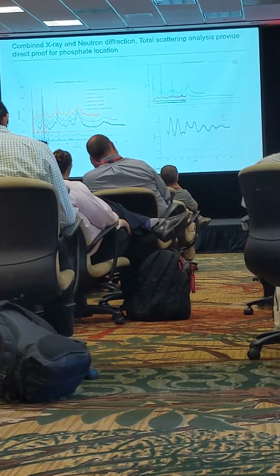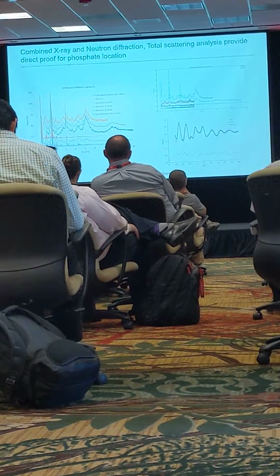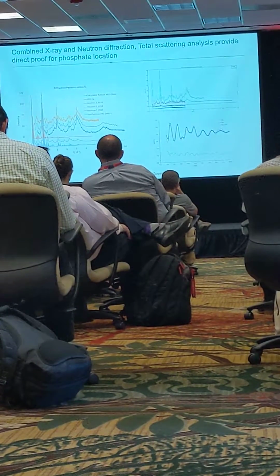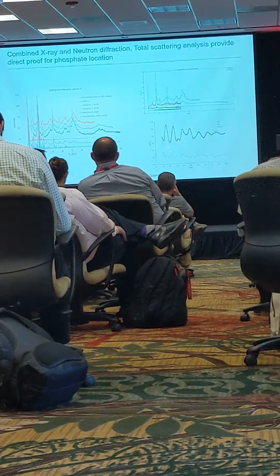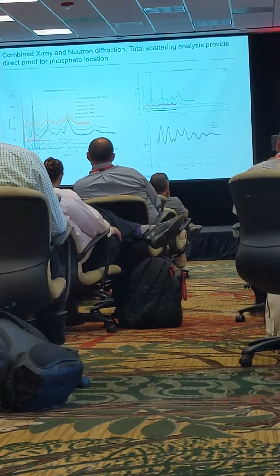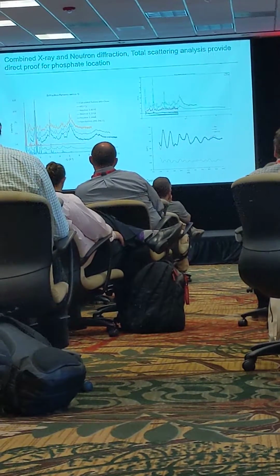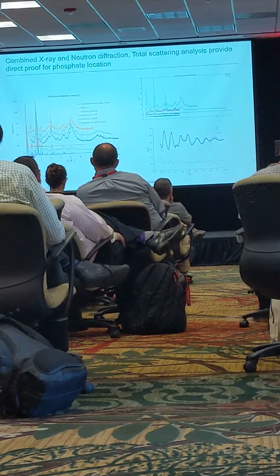It's actually telling us key things about the average interatomic distances and the structural disorder and the levels of coordination. And we can actually decipher that out. And the way it's done is by transforming the data and starting to do a little bit of guesswork, okay? This particular plot right here is something called G, or the pair distribution function versus R, which is the interatomic distance. That's basically a Fourier transform of that scattering data. And that tells us all the detailed information about atomic configuration.